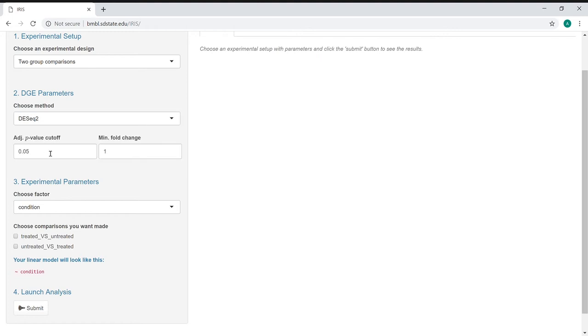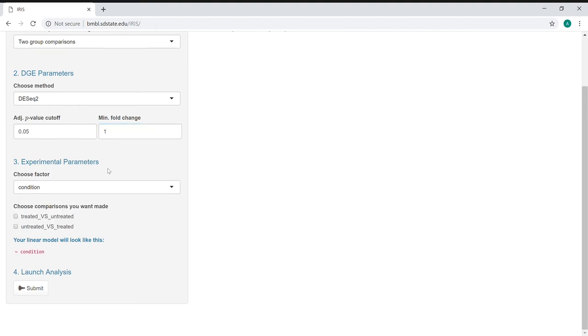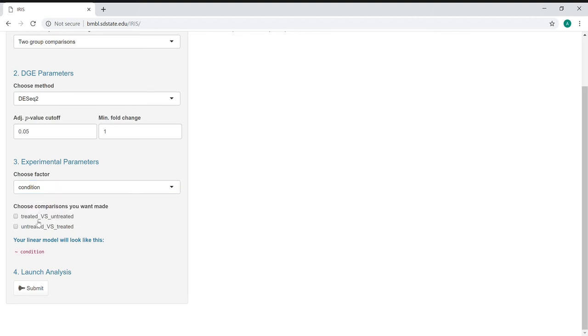We have an adjusted p-value cutoff that will specify if it's below this threshold, then it's considered significant, and a minimum log-based fold change threshold that determines whether or not it's a significantly different comparison. We can then select our experimental parameters. In this case, we're going to look at either condition or type, and we would then select the comparisons we actually want made.